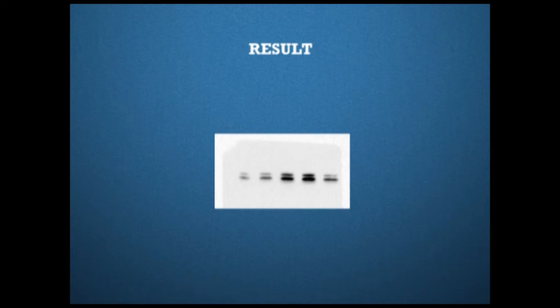In the result, the target protein is detected and the levels in the cells or tissues are evaluated through densitometry and location of the visible protein bands confirmed with molecular weight markers.